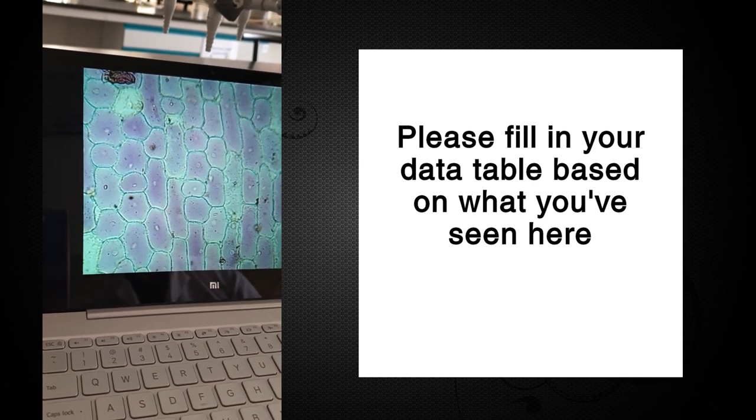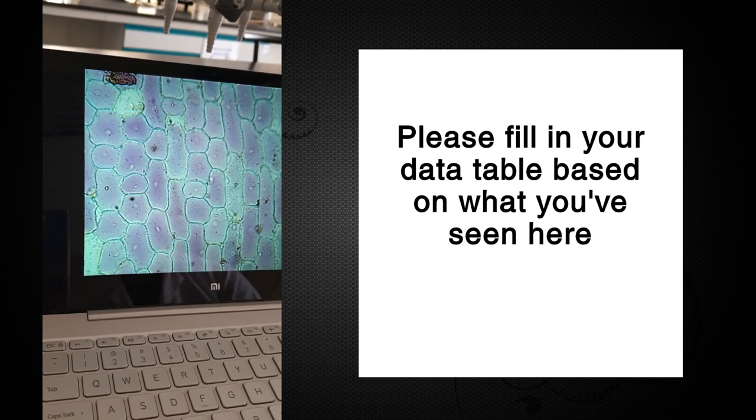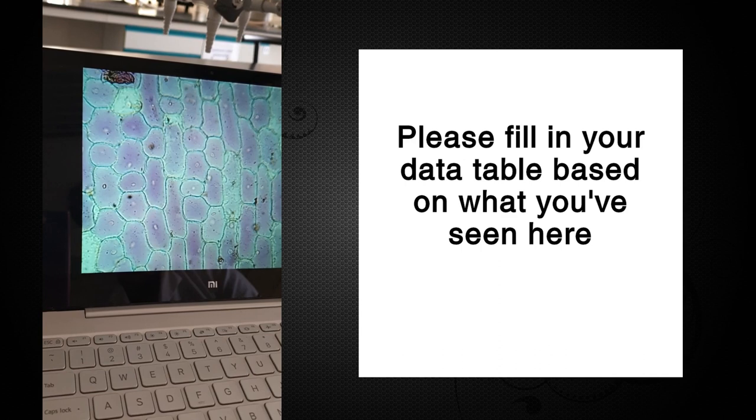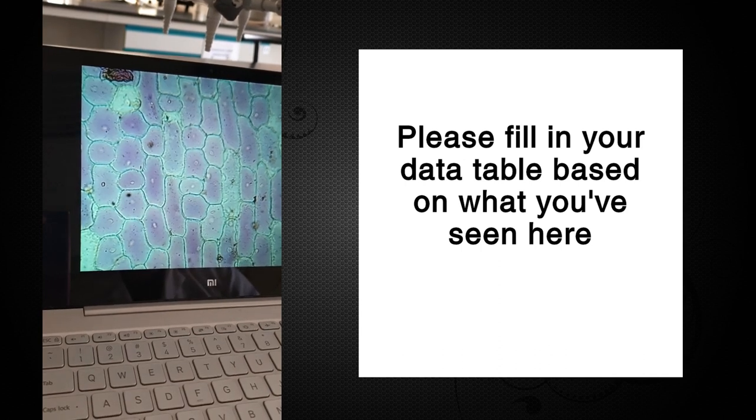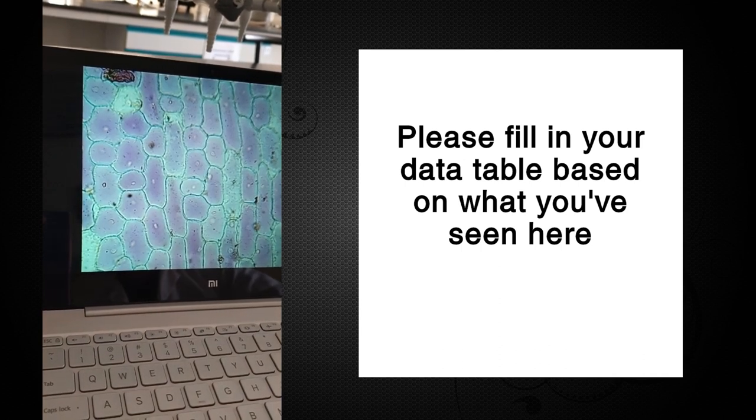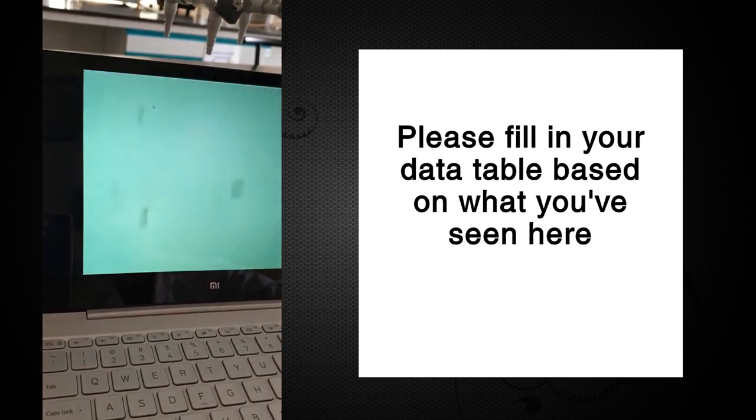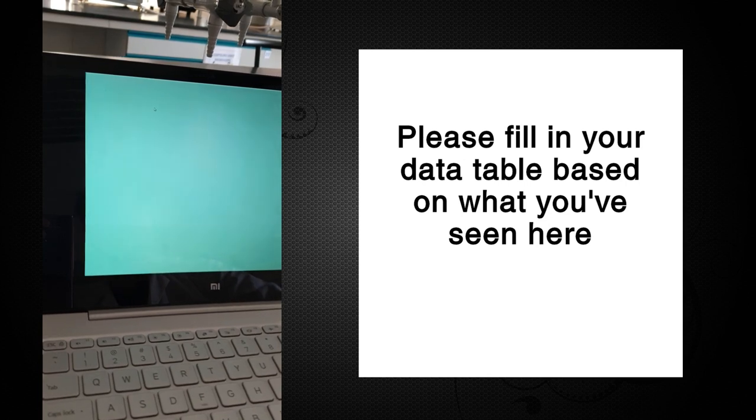Now let's switch over. This is the slide that is incubated in water. So these are onion cells in just a hypotonic solution. So they are a little swollen. Now, if we were to put in the 0.9% salt slide on here, it really wouldn't look that much different. So we're not going to do that.